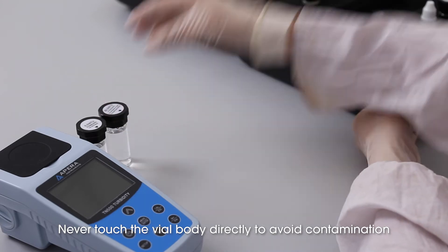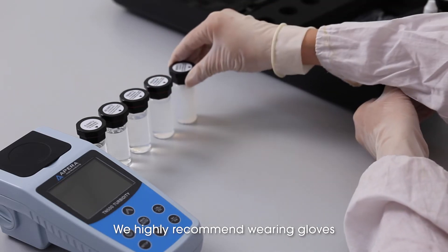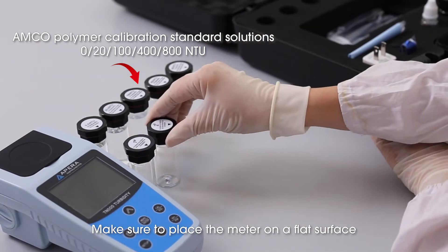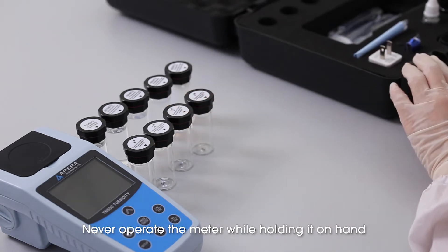Never touch the vial body directly to avoid contamination. We highly recommend wearing gloves. Make sure to place the meter on a flat surface. Never operate the meter while holding it in hand.